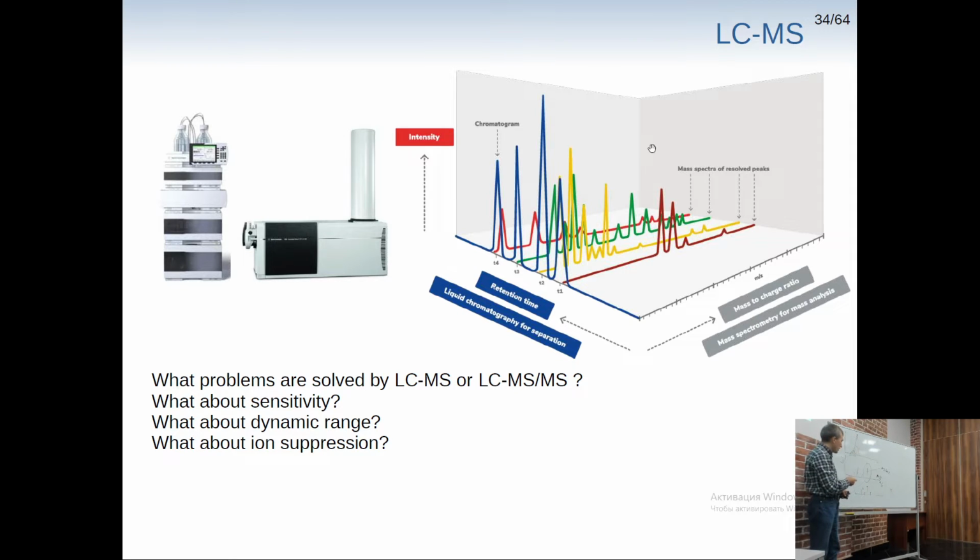What do you need to choose? Will you choose the same ion the second time? So you have to exclude this ion for some time, for instance, and get the second highest ion, and also make an MS/MS from it. So you need some rules which allow you to choose which ion to analyze, which of those peptides to analyze at which time.